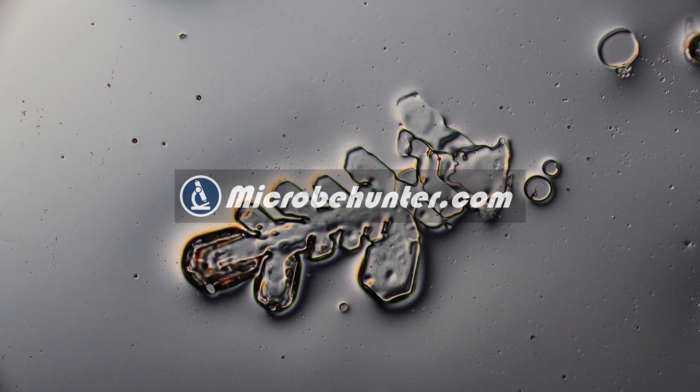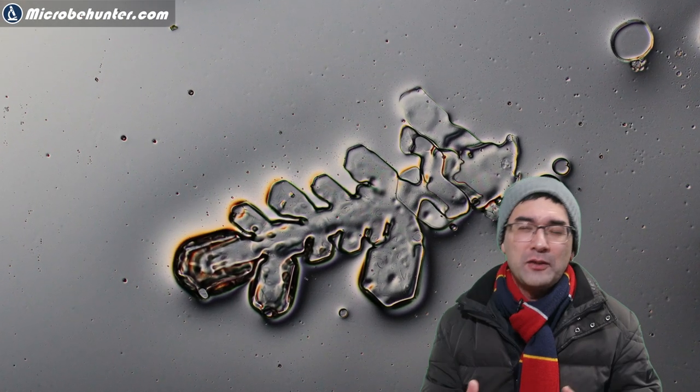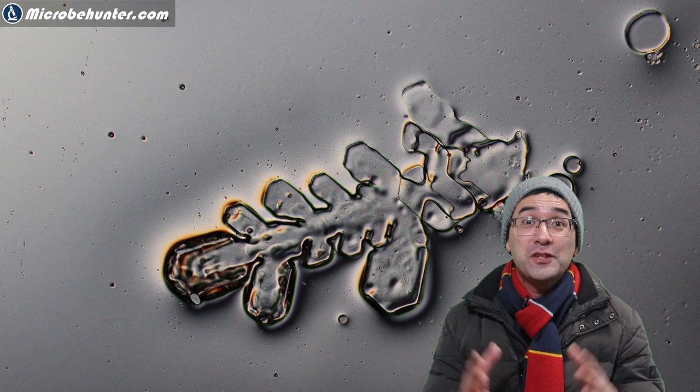Well hello and welcome, microbe hunter here. Well this here is a snowflake, or at least a part of a snowflake. It's frozen water, an ice crystal.